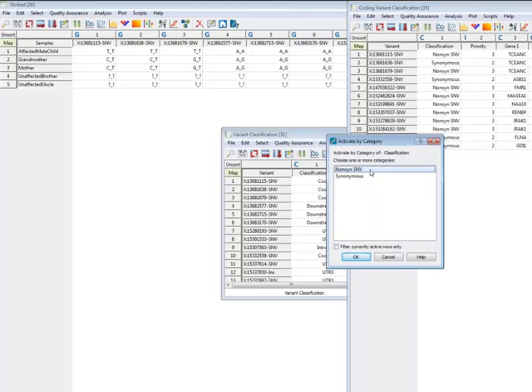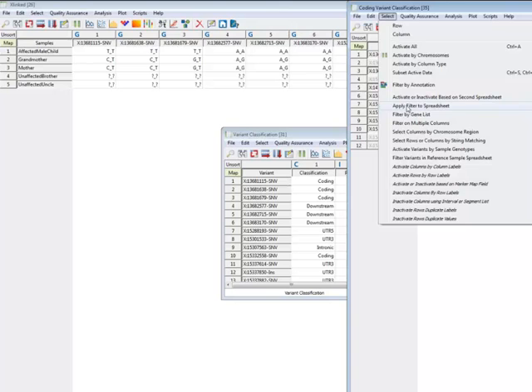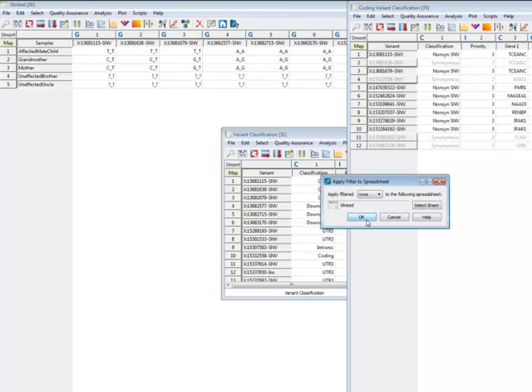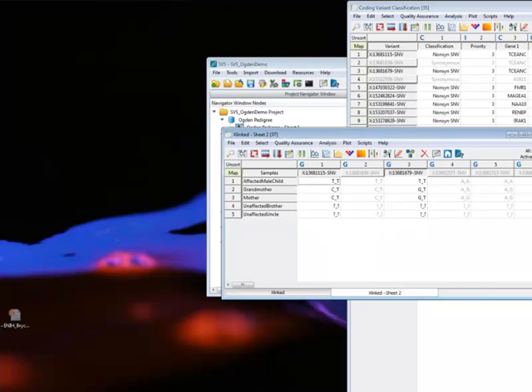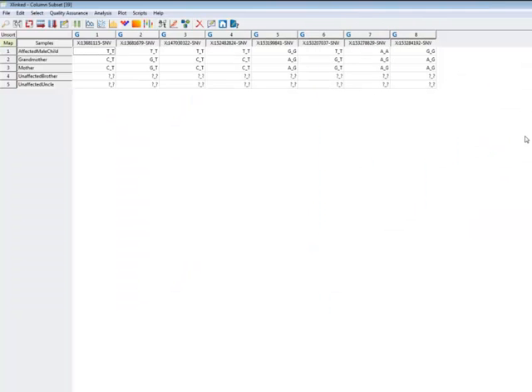So I'll activate the non-synonymous and pick those out of the parent spreadsheet. So from this X-linked sheet now, I see I just have 8 columns active. Those are my 8 non-synonymous X-linked candidates. So what can we learn about those?